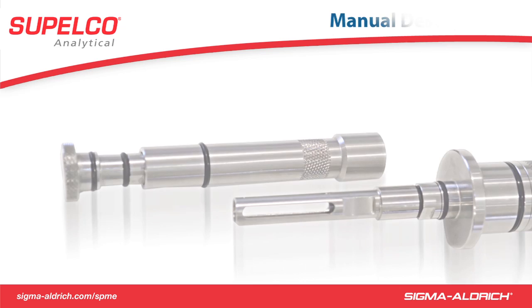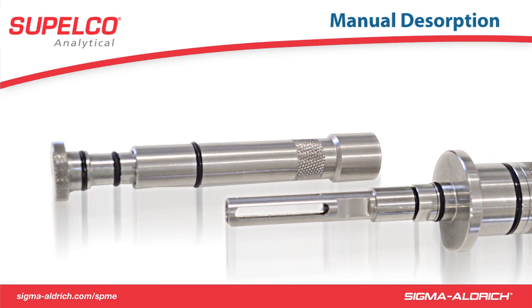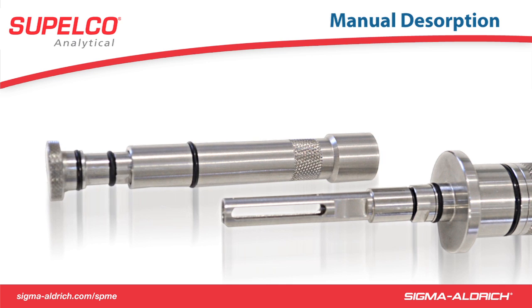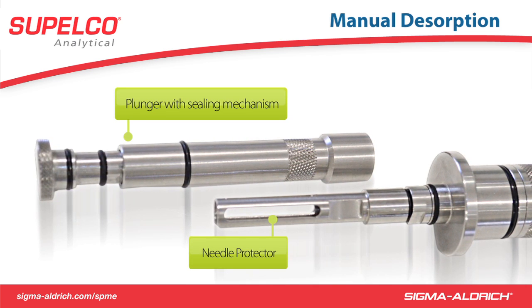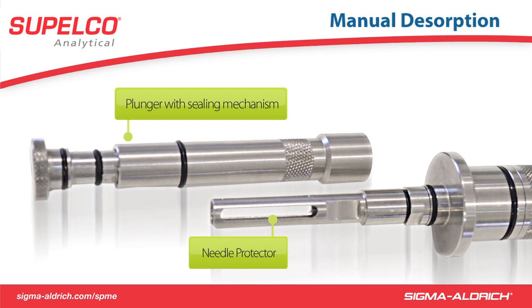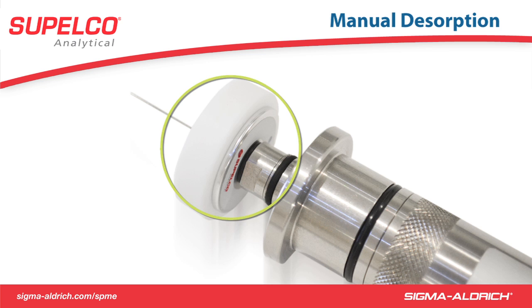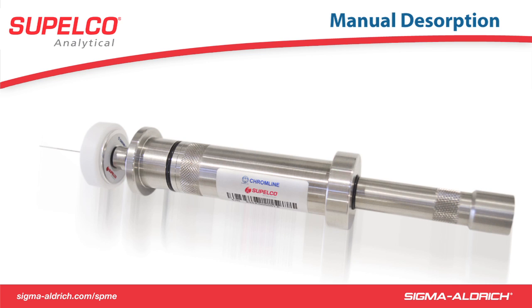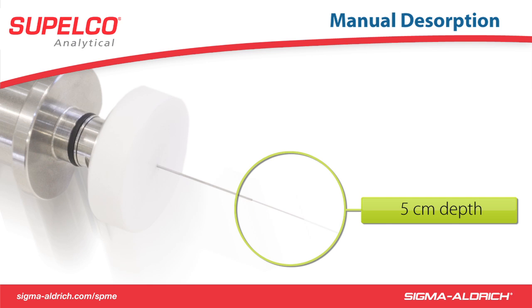Upon reaching the lab, the FFA field sampler can be used to manually desorb the contained FFA fiber into a GC instrument. To perform this, the plunger with the sealing mechanism is taken off and attached to the back of the sampler like performed when sampling. Then, the needle protector is replaced by an optional manual desorption adapter. The manual desorption adapter ensures an injection depth for the exposed fiber of 5 cm, which is suitable for most GC injectors.